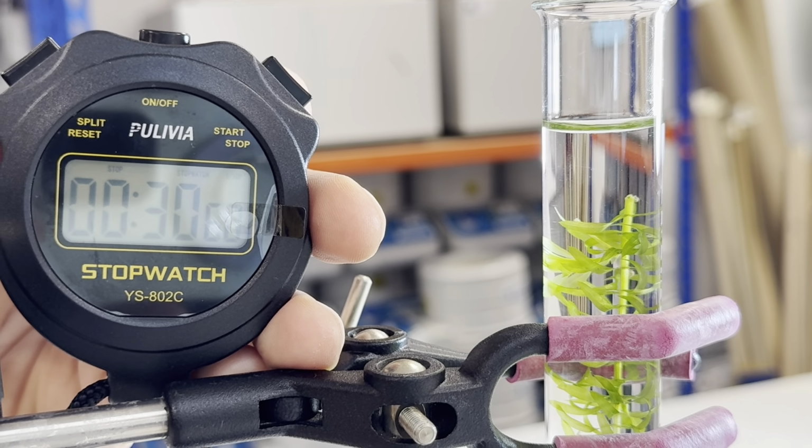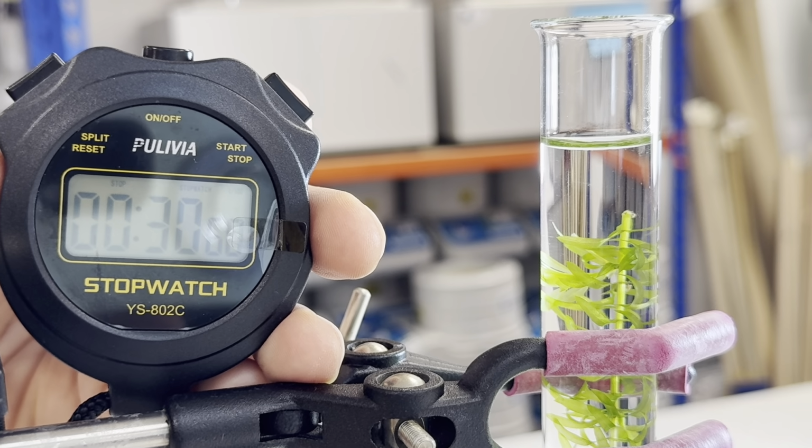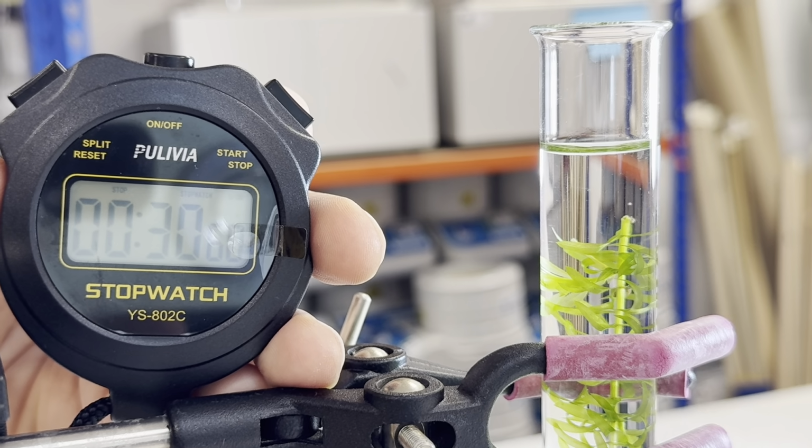So we had 31 bubbles in 30 seconds, okay? Almost 1 bubble per second.